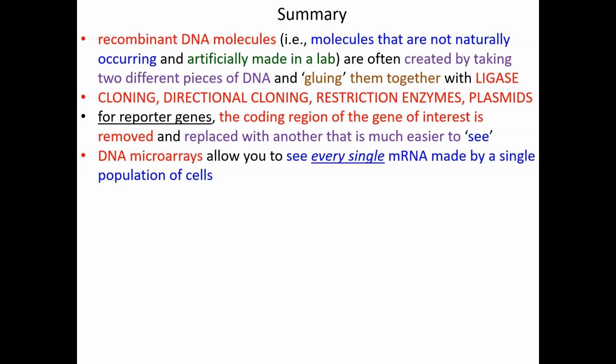We do this by isolating messenger RNA, reverse transcribing it into fluorescent cDNA, denaturing or melting that cDNA into single strands, and then adding that to the microarray. The microarray itself is a grid system with single-stranded DNA probes representing every single gene. Each grid square gets its own gene, and where these fluorescent cDNAs bind and anneal due to their complementarity causes that grid square to fluoresce, and we can detect the presence of that cDNA for that gene, which correlates to the messenger RNA for that gene, and we know that gene was being transcribed. So awesome stuff. I never get sick of it. Hopefully you have some appreciation for its awesomeness as well.